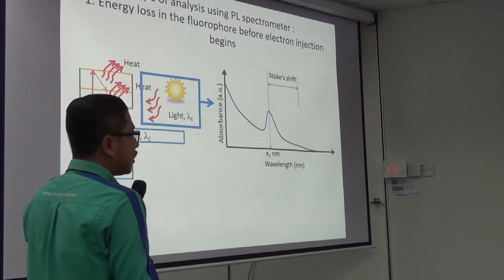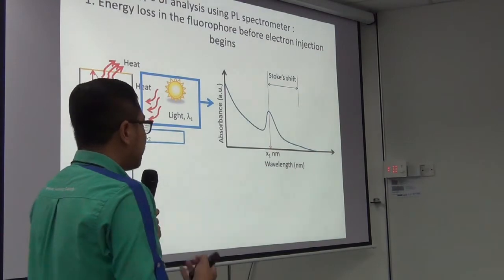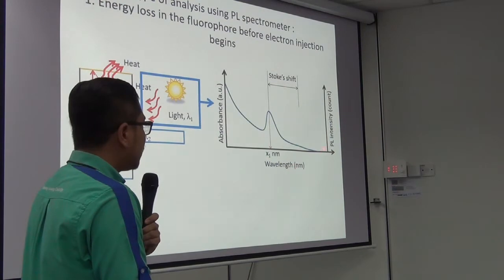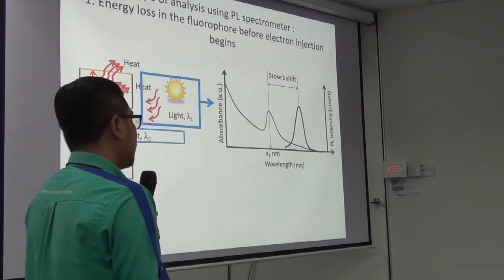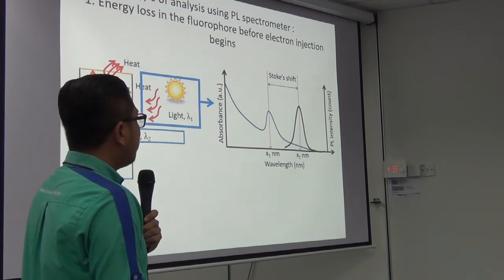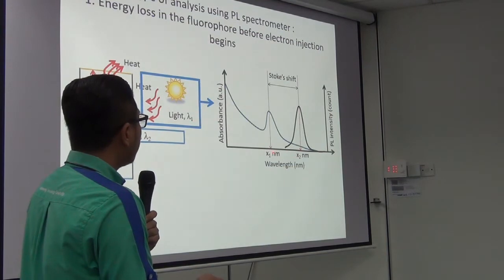And the light that is being emitted could be studied using the PL spectrometer. And PL spectrometer is known as emission spectra. And we plot the graph with the next y-axis, this is y2, PL intensity, against the emitted wavelength, and the graph could look like that, Gaussian type graph. And we take note of the position of the peak of the PL. This is not x, this is actually lambda. Lambda 1 and lambda 2. See, lambda 2 over here, lambda 1 is over here.